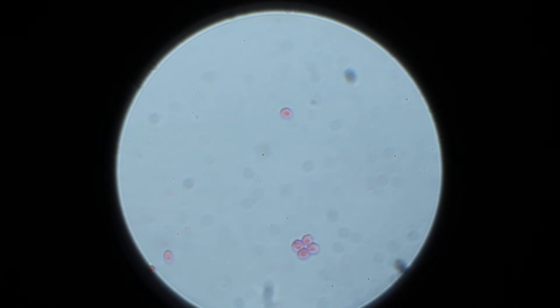And we're coming up from the center. We're starting to see some diffraction rings around inside the cells, as the part that's in focus becomes only the top of the cells. And now we're getting to the point where there's basically nothing we can see. We're right at the very top, and now we're above it.